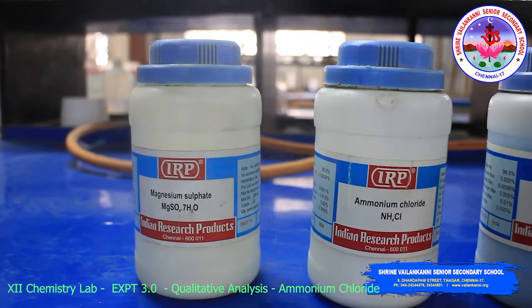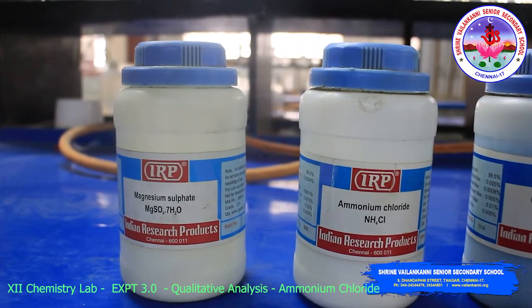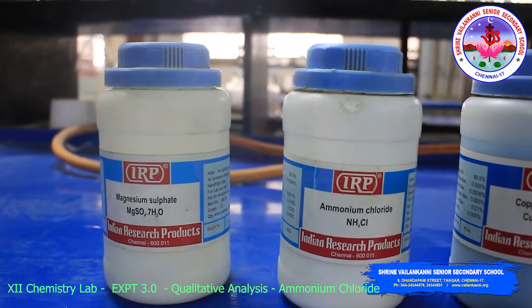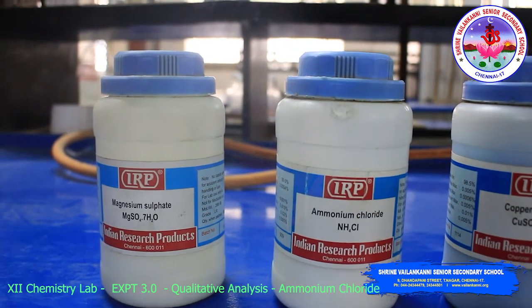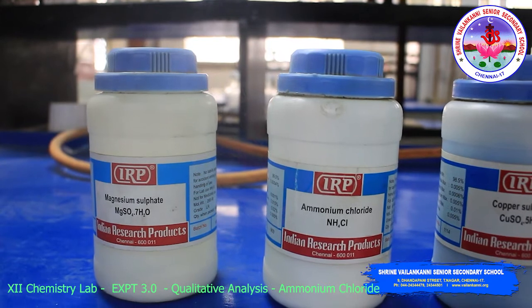Students, we will perform these salts. Usually in the examination we don't tell what salt is given, you have to identify it with the help of the systematic procedure.